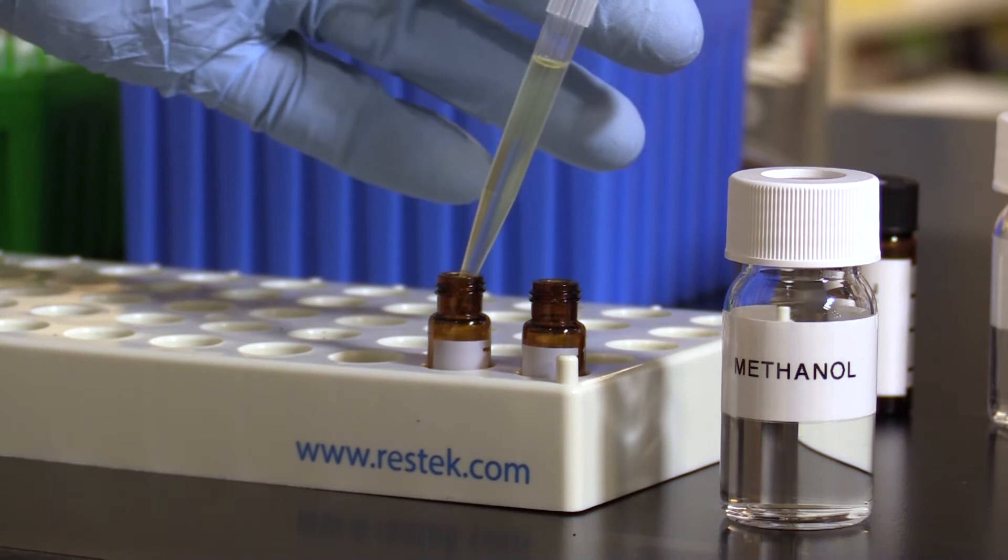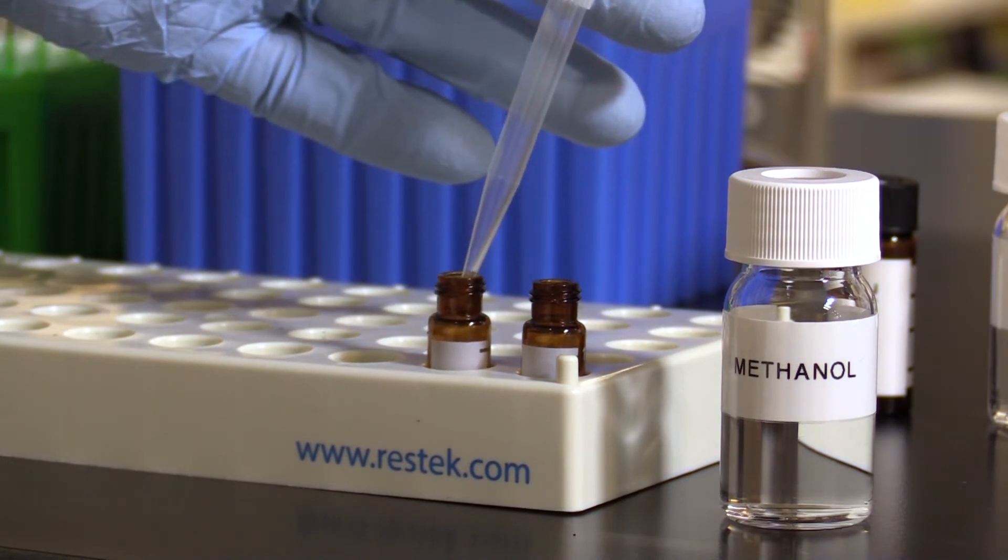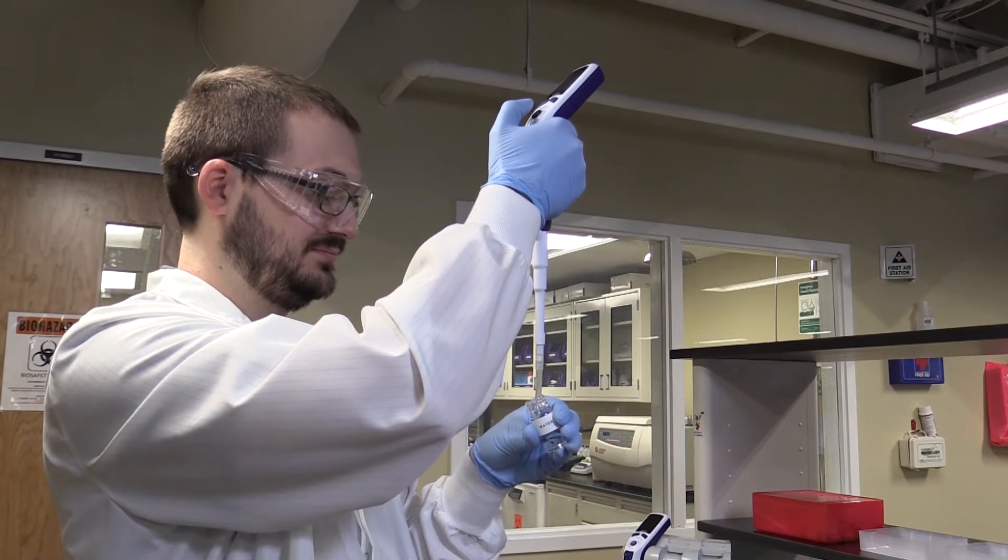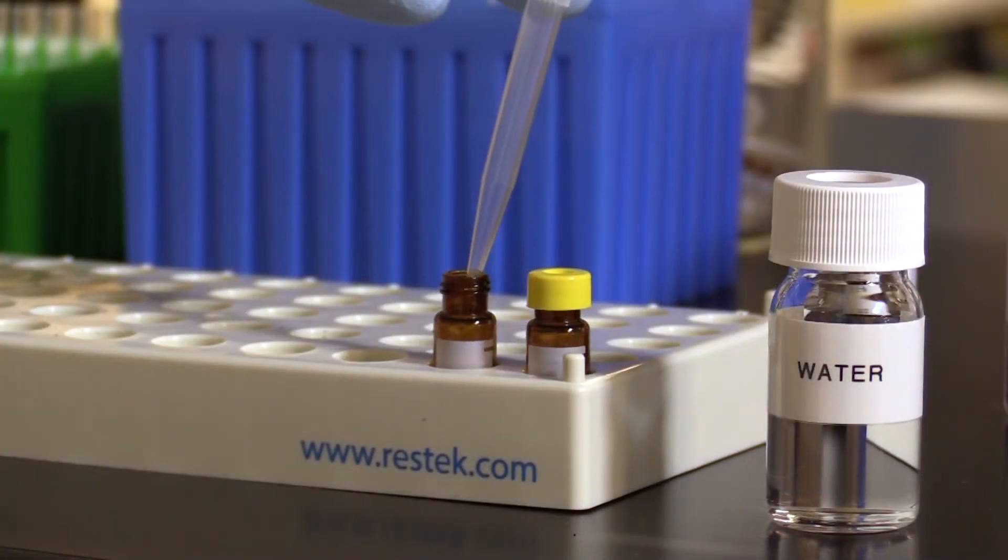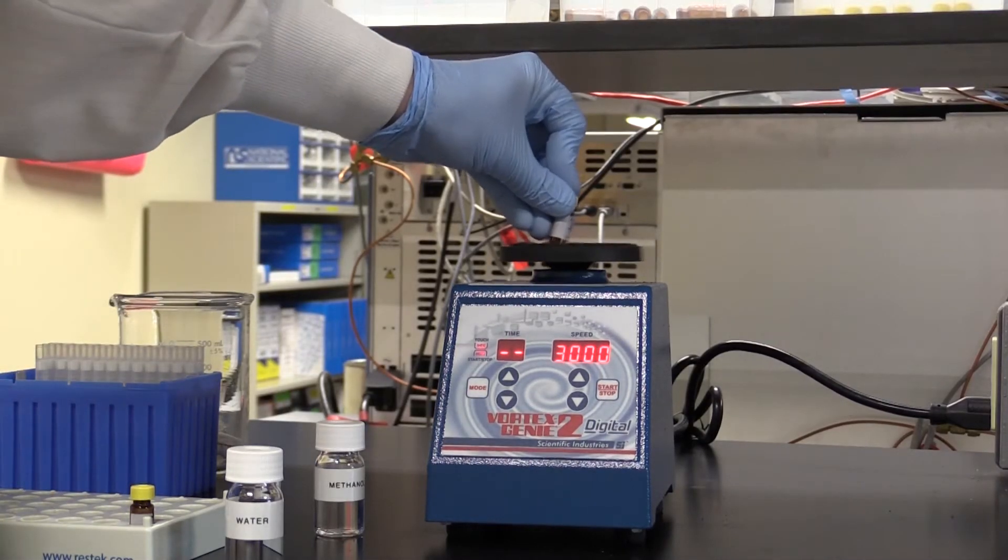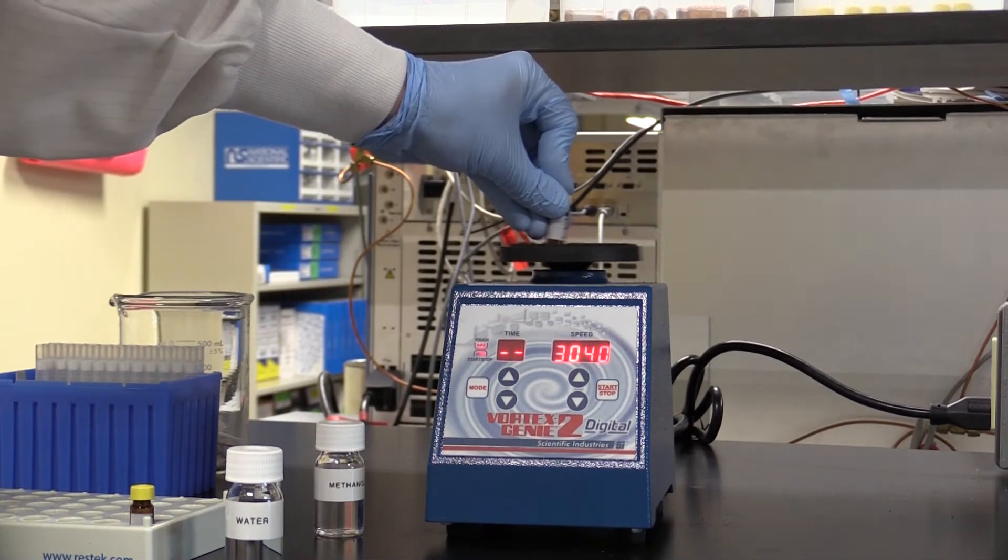Next, a 750 microliters sample solution is placed into a new amber vial. We then add 250 microliters of water into this in order to initiate matrix precipitation. Now vortex the new sample solution again, this time for 10 seconds at 3000 rpm.